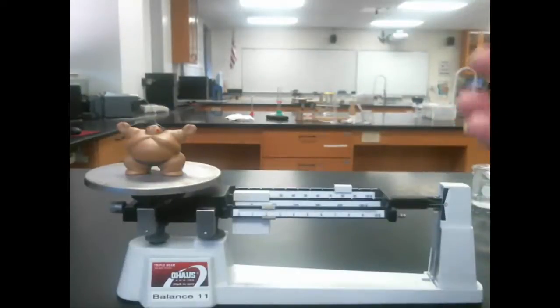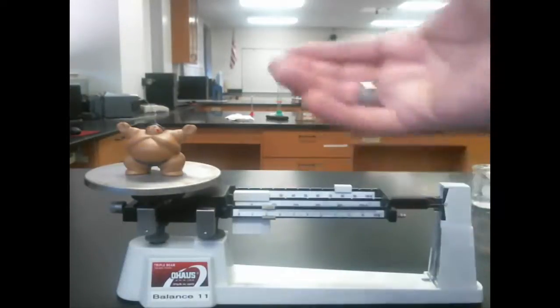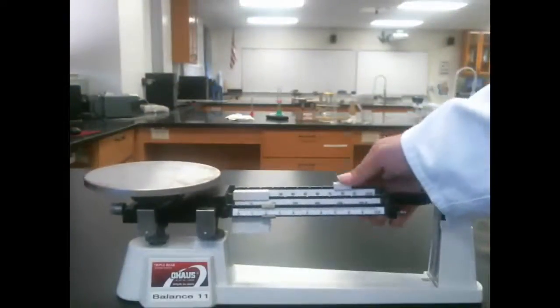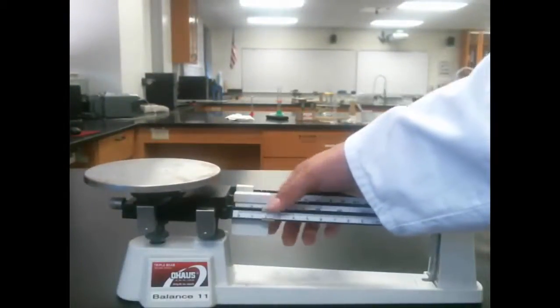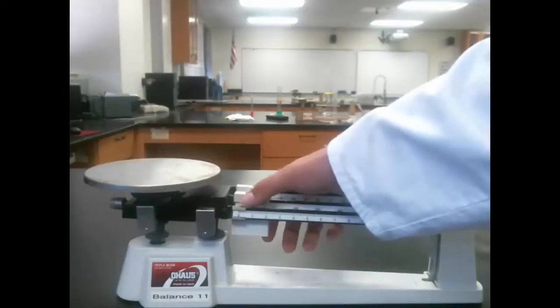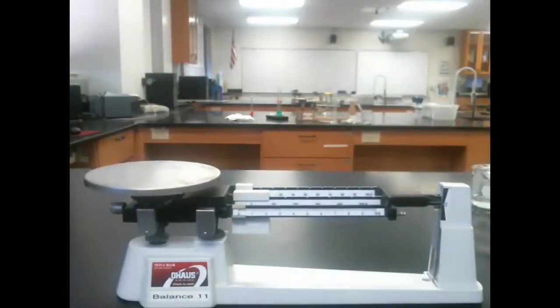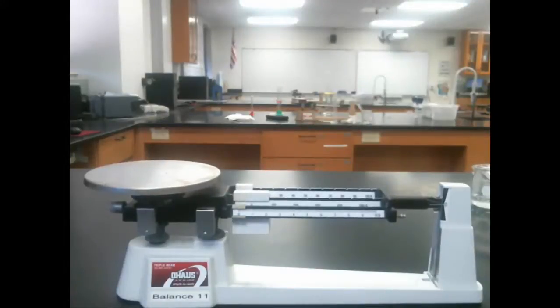When you're done, the most important thing about a triple beam balance is to put it back to zero, so that you don't accidentally mismeasure something the next time you put it on. So take the object off the balance pan and re-zero the sliders.